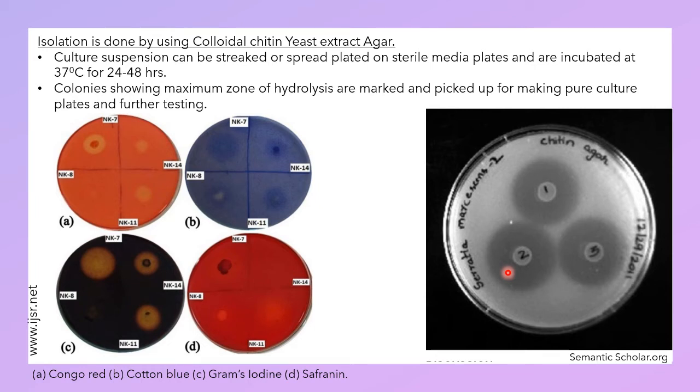This is what you should get, but if these clear zones are not visible, then you can stain your plates. This is from another research article where stains are used to get a clear idea about the zone of degradation.